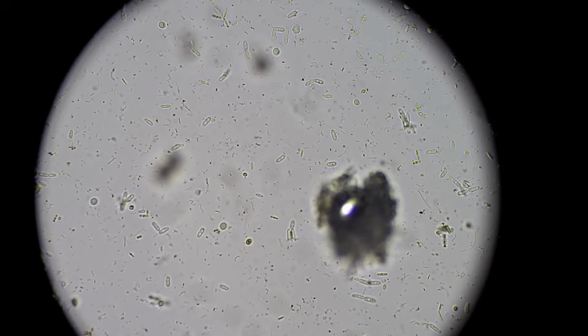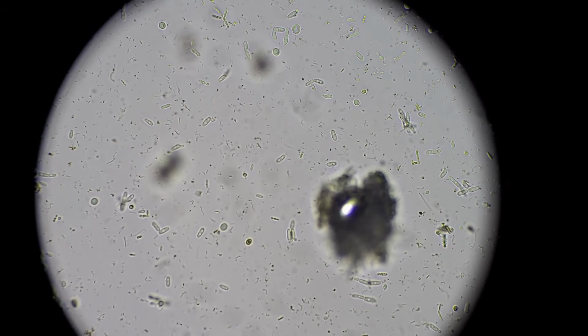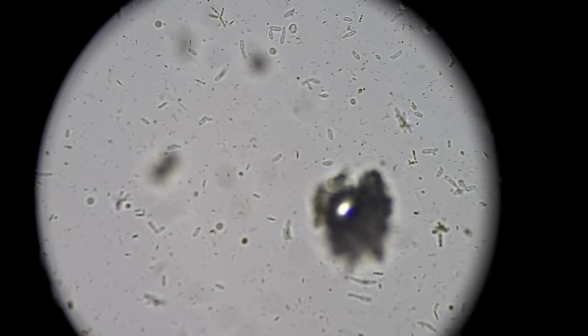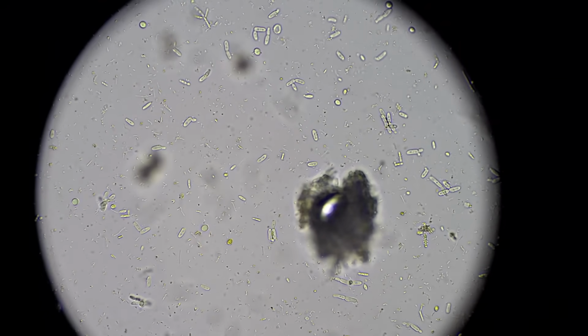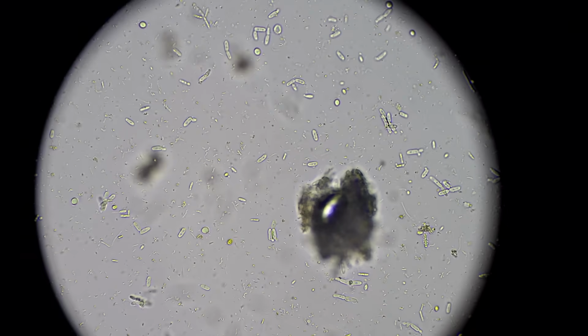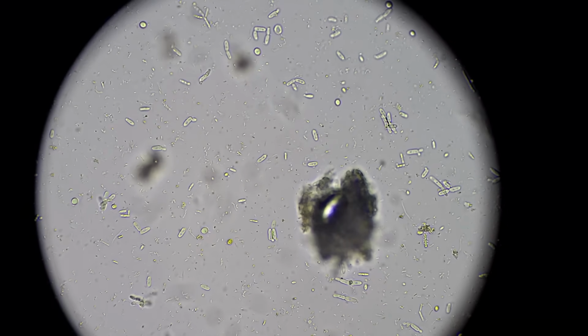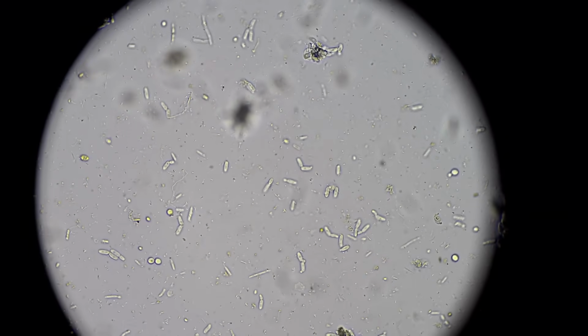We want to see the yeast dominant. We want to see lactobacillus dominant and policing things and keeping things in the right direction. We want to see yeast flakes. And then if we're lucky, we get to see some stars. So I've added very specific microbes over time to a brew that was already focused on them, and it's acted like training wheels. So I feel really, really fortunate.